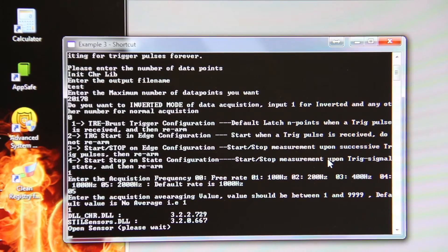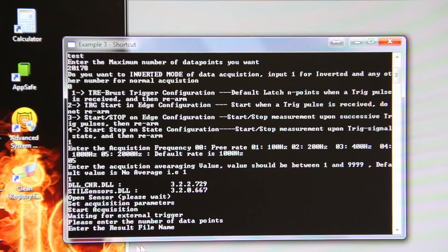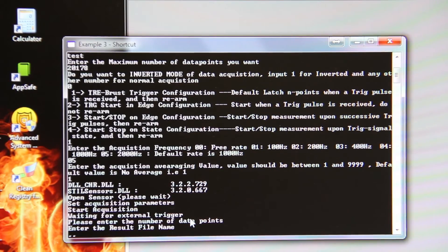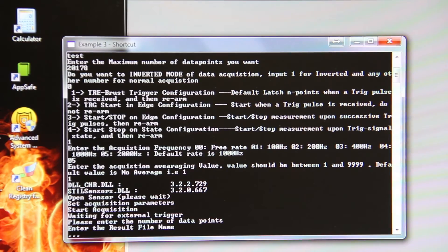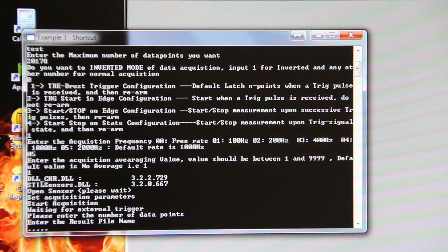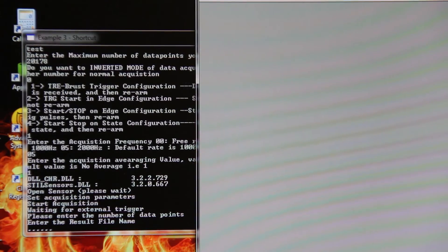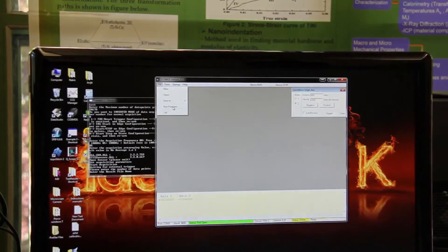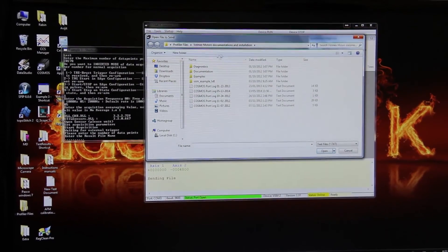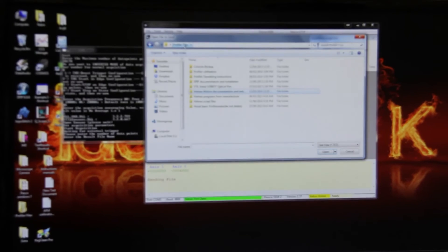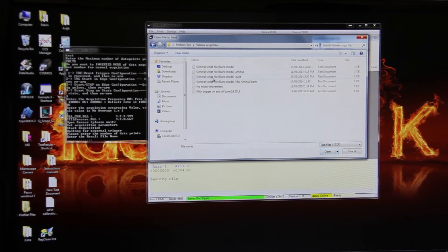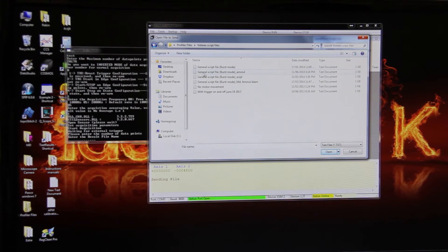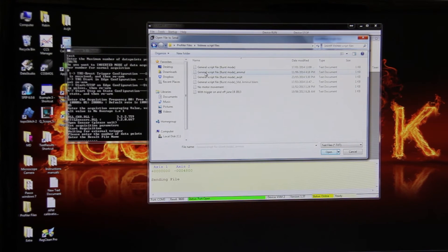Then it will ask you to open the sensor and enter the result file name. So you need to open the sensor. In order to do so, go to Cosmos, go file, run program. Now go to profiler files, Velmex script files, and the script file you just saved. Open that script file.